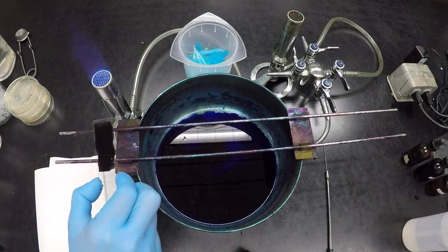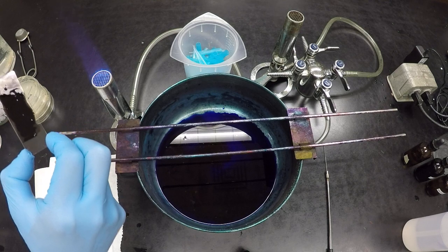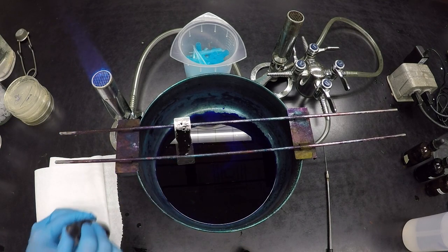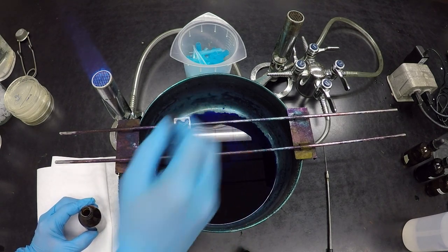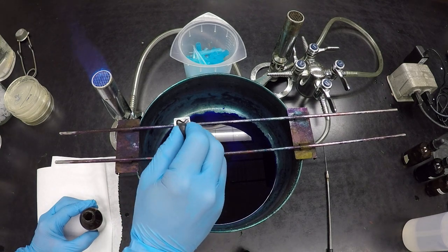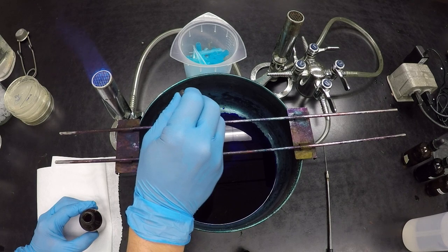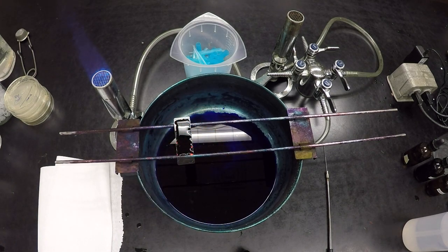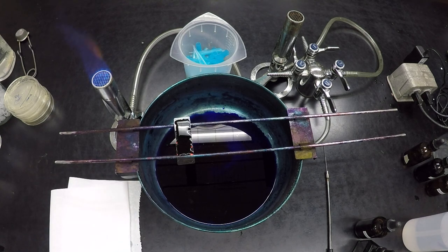Now, there are a number of different ways to do this. This should air dry, right? And it's, well, let's just call it close enough, just for demo purposes. And then you want to add the safranin to this. And when you add the safranin, add it very gently, right? And again, cover the slide. Now, it says a minute, but I find that the longer you leave it, the more successful your capsule stain is going to be. So I often leave this for a few minutes, just to run off, go talk to someone, talk about whatever you want, and then come back when it's ready.